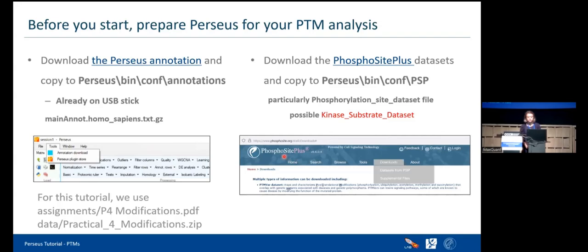This website has a lot of information about phosphorylation and other PTMs. We go to the download tab and get the dataset from PhosphoSitePlus. We sent an email on Wednesday evening about this because we are not allowed to distribute the dataset — you have to download it yourself. For this tutorial, you need the phosphorylation sites dataset, and when you want to analyze kinase-related information, you also need the kinase substrate dataset. Make sure you have all required PhosphoSitePlus datasets.